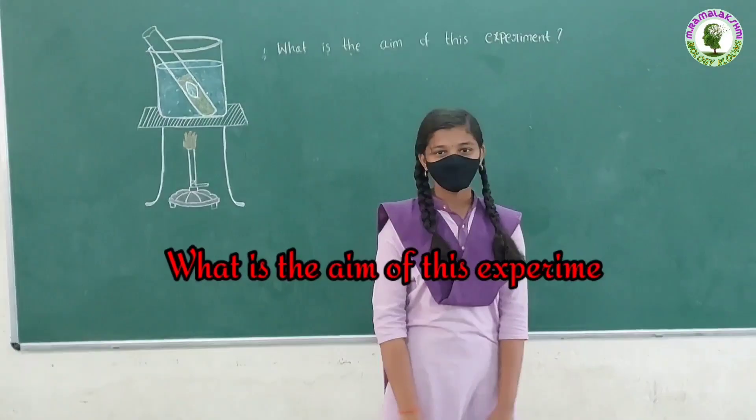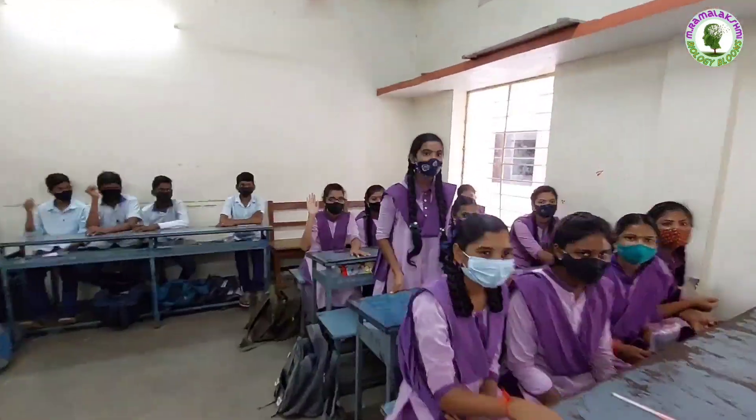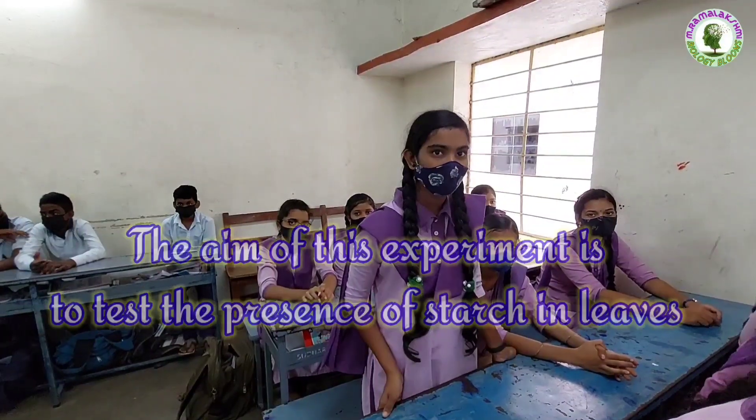What is the aim of this experiment? Asha: The aim of this experiment is to test and prove the presence of starch in green leaves.